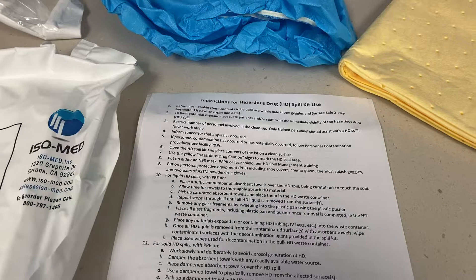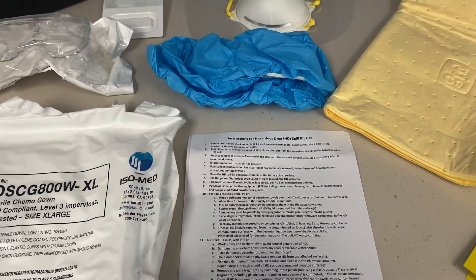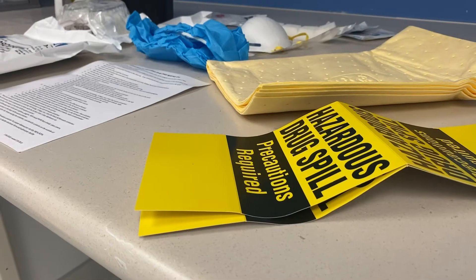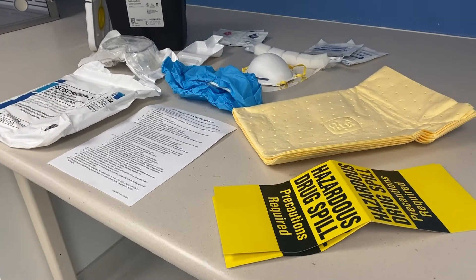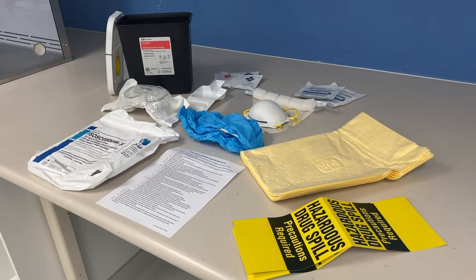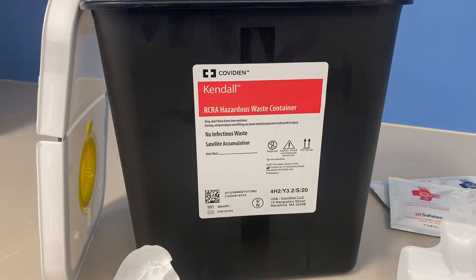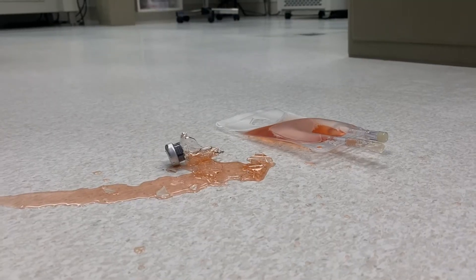Contents include instructions for HD spill kit use, two HD spill caution signs, shoe covers, N95 masks, face shield, two pairs of large gloves, disposable goggles, chemo gown, extra large plastic pan and plastic pusher, three 15 by 20 absorbent towels, surface safe two-step kit, HD exposure report.